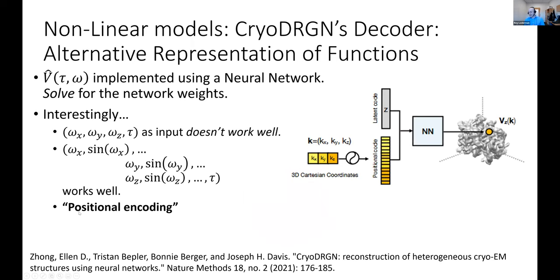So like I said, this isn't necessarily the only way of writing these functions. One of the really surprising things that came after this was this software called CryoDRGN, and they introduced two really cool ideas. That wasn't my work. One of them is how to represent these functions.